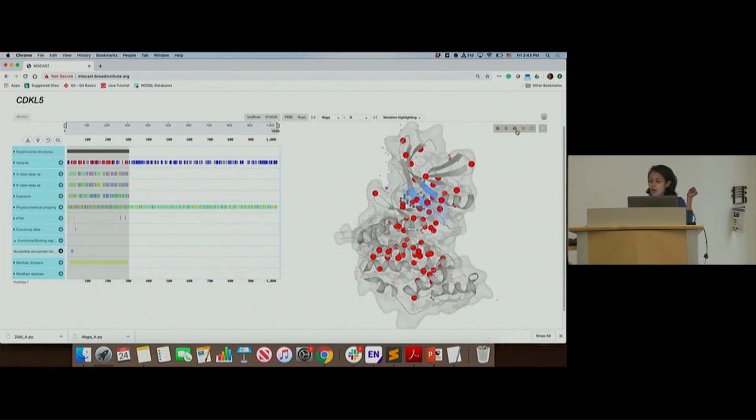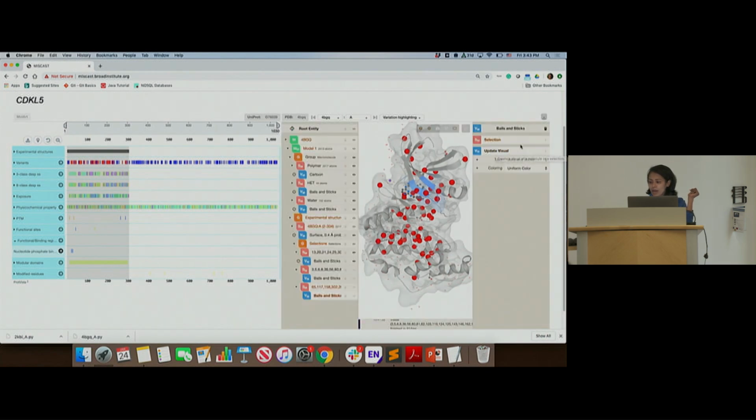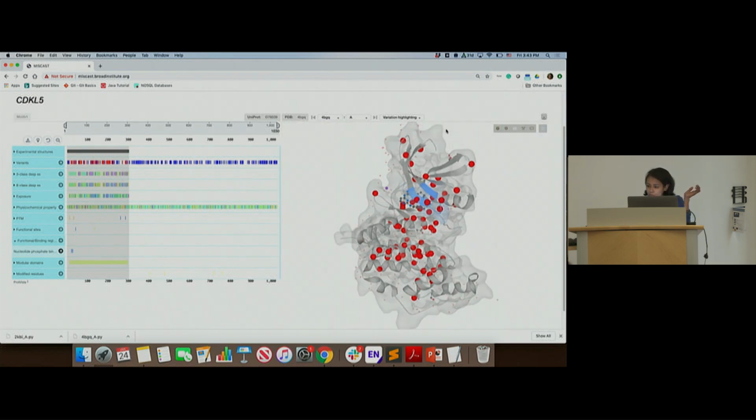There is a snap that you can take from here, and you can bring in all the options to see it as sticks, as spheres, but I recommend not doing it online, though you can if you want. So it's the little tool icon that you have to select to bring out those tools to explore online.